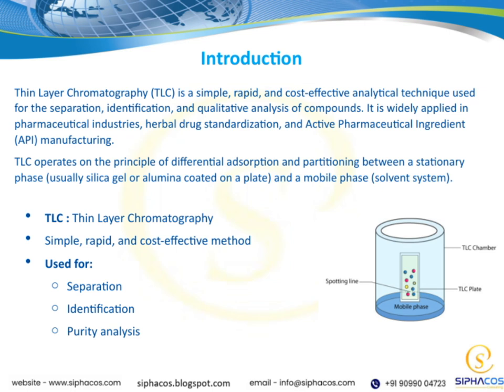In the context of our overall discussion, TLC plays a significant role because it allows us to analyze mixtures efficiently and accurately without the need for complex equipment. The way TLC works is based on the principle of differential adsorption and partitioning. Essentially, we have a stationary phase, usually silica gel or alumina coated on a plate, and a mobile phase, which is a solvent system.